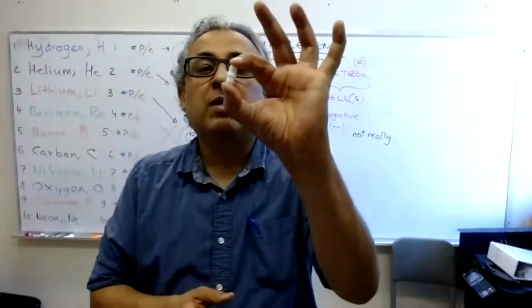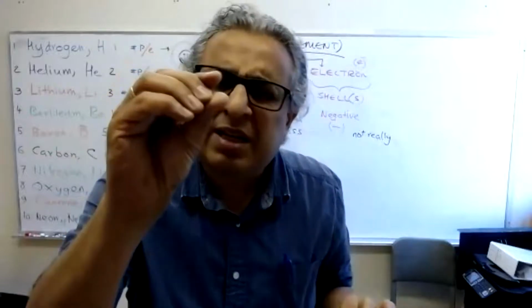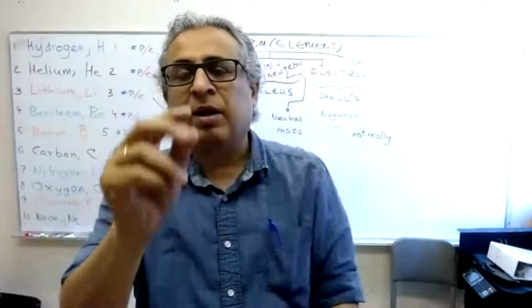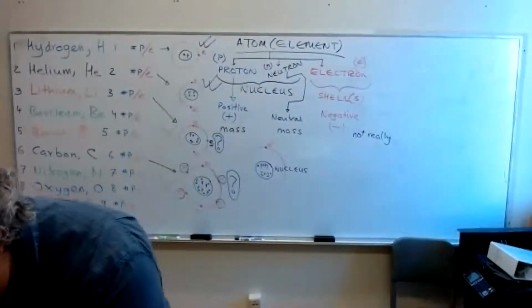The stir bars come in different shapes and forms, like the tiny ones, really tiny, maybe a few millimeters long and very, very tiny. This is a 1-inch stir bar. You can get a 1/2-inch stir bar. They can come in different shapes and forms.